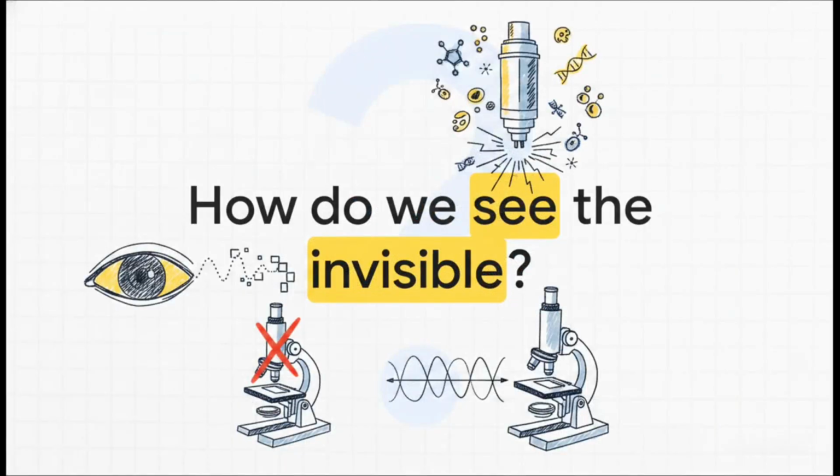It all really starts with a fundamental challenge. Pose this to yourself. How exactly do we see the completely invisible? Our human eyes are biological marvels for sure, but they have a hard limit. Even traditional optical microscopes, the kind you probably used back in high school biology, eventually hit a brick wall dictated by the wavelength of light itself. To truly understand modern engineering, medicine, and chemistry, we have to look much, much deeper. We need a tool that absolutely shatters those traditional limitations.